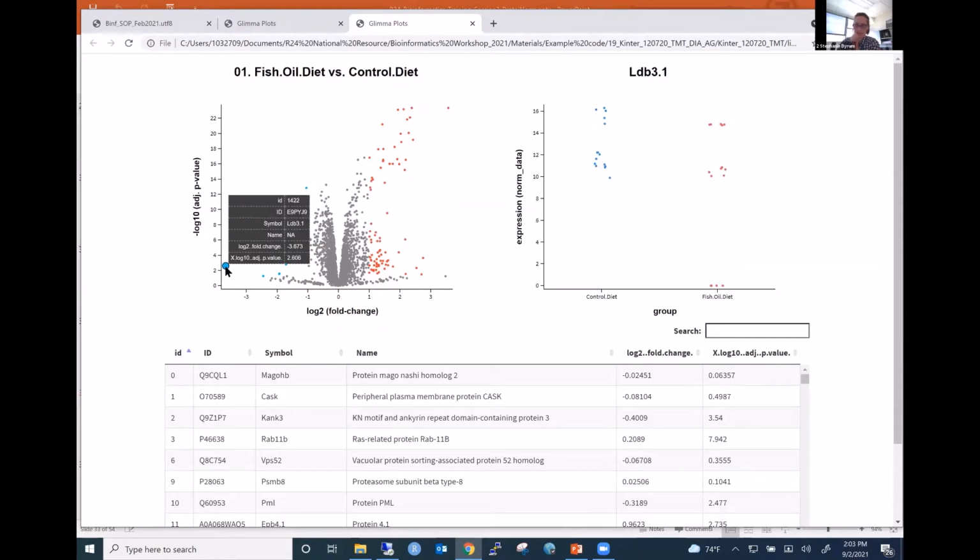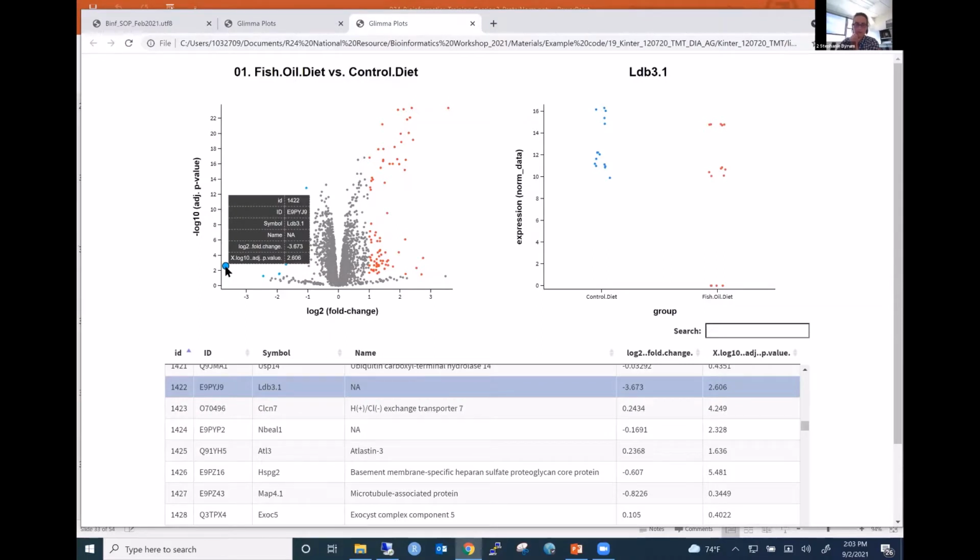But a lot of these here on the TMT, this is where you can start looking at these outliers and see that those samples actually have a missing value. So your overall fold change is actually not that different, but it's got a missing value here that's influencing that value. And you can start to see within these replicates, this is batch 1, this is batch 2 and 3. So you can actually see in the normalized data set the batching effect and how it's impacting those results a little bit.